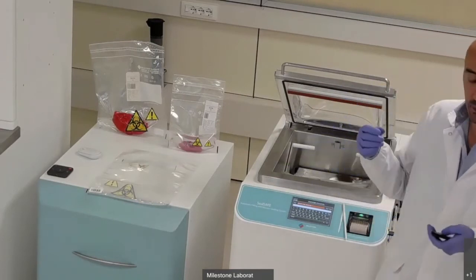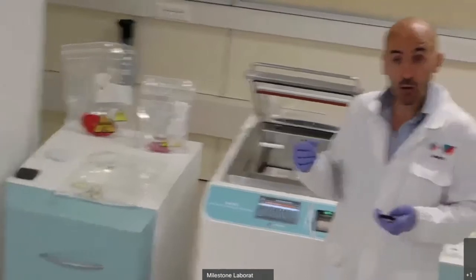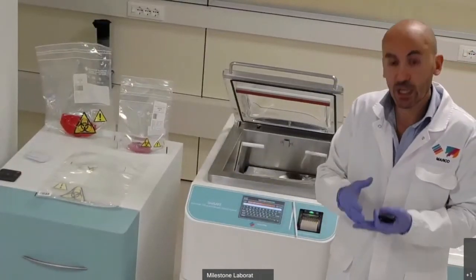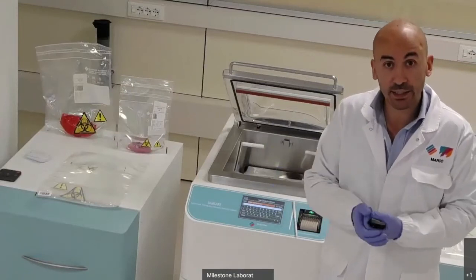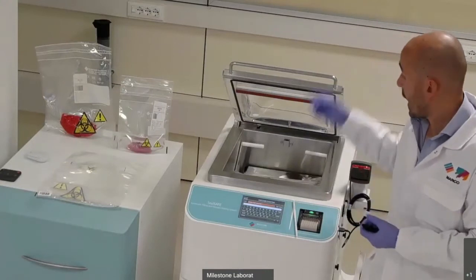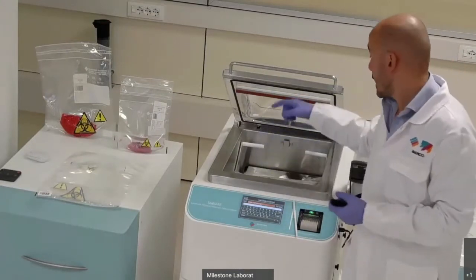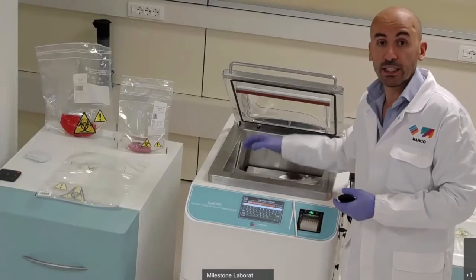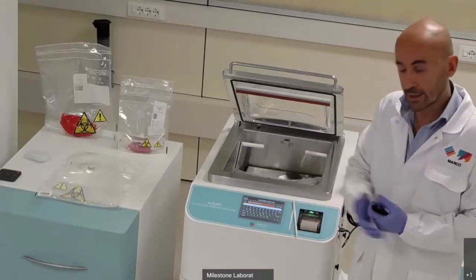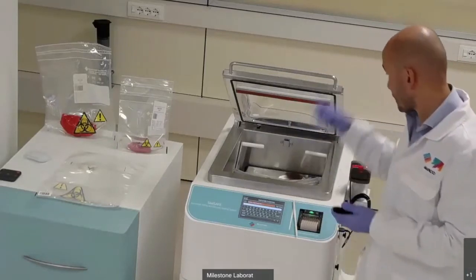And now we are not speaking just of dispensing formalin, but also of precisely tracking when the fixation has started and how much formalin you poured into the bag. In order to do that, in the cavity here, you do have a scale to monitor the weight of the specimen and the precise amount of formalin.